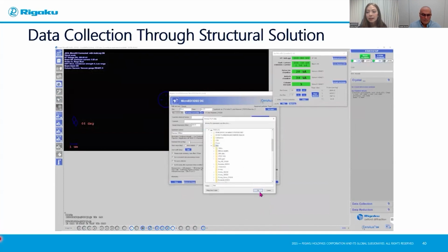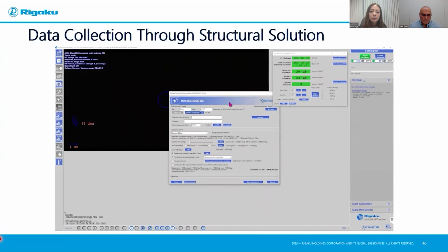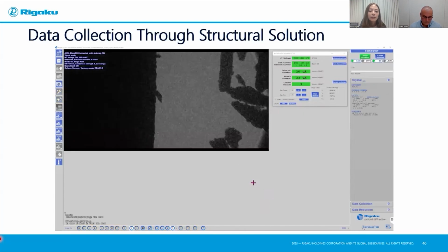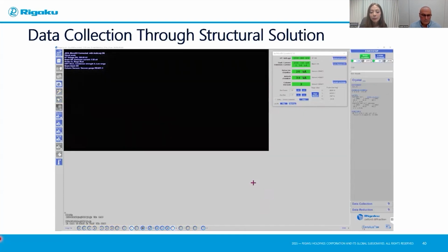The first thing that I'm doing is naming my grid and my data set name. We will be running this through AutoChem, so I am putting in the atom types. The other thing that I'll adjust here is my exposure time and the rotation range that we just determined by tilting and centering our crystal. At this point, we have some automated settings that we could add in with some post-collection analyses. But here I will click the Start Experiment button and we will start collecting our data.